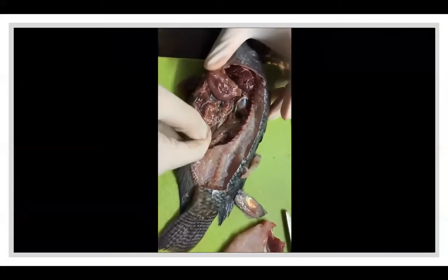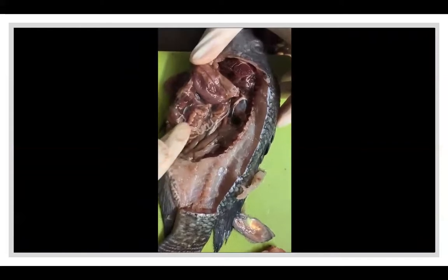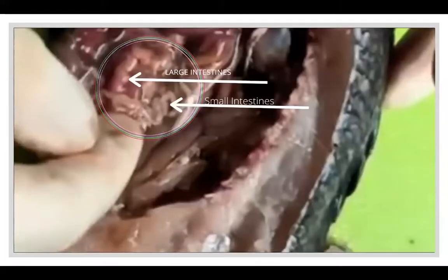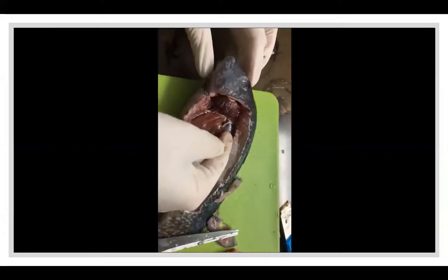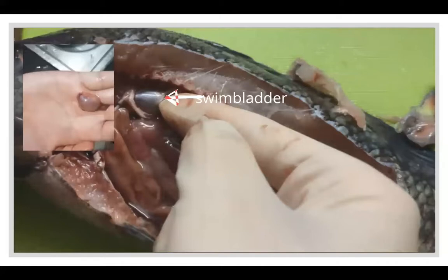Now let's identify the different internal organs of the fish. These long, thin, coiled tubes are the small and big intestines. Fish such as tilapia are herbivorous and have longer intestines because plant matter is tough, fibrous, and more difficult to break down compared to piscivorous fish, which have fairly short intestines because such food is easy to chemically break down and digest. This hollow, gas-filled organ that sits in a fish's body cavity above its guts is the swim bladder; it allows a fish to conserve energy by maintaining neutral buoyancy in water.